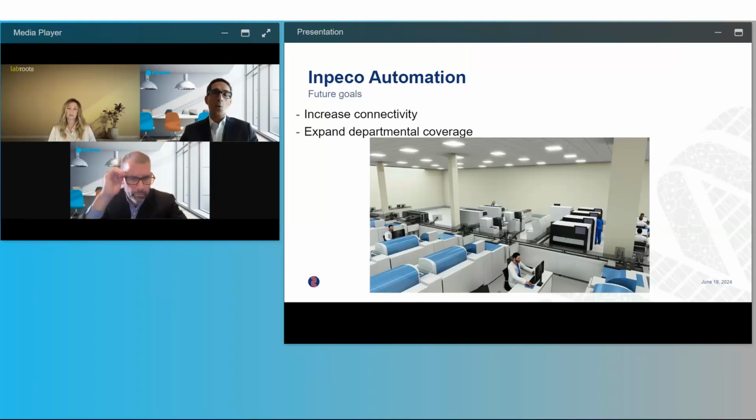So this is what automation is providing, but this is just one element of automation. I've also highlighted that automation brings traceability. Traceability means control and means quality of results. And that is our end vision, to really provide the result which in the end the doctors and patients can rely on.